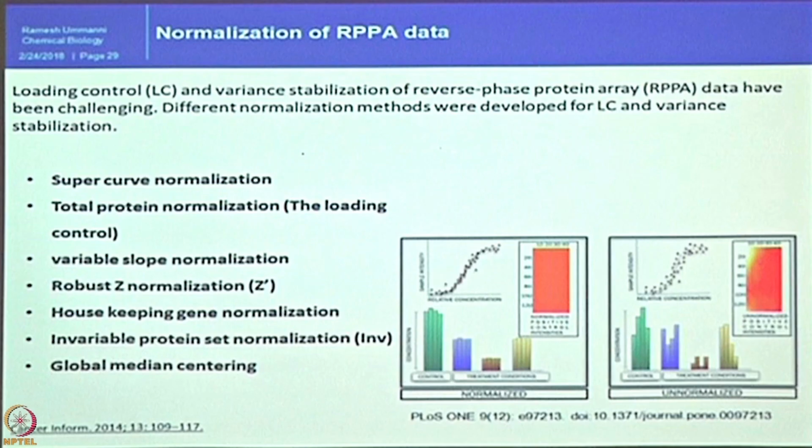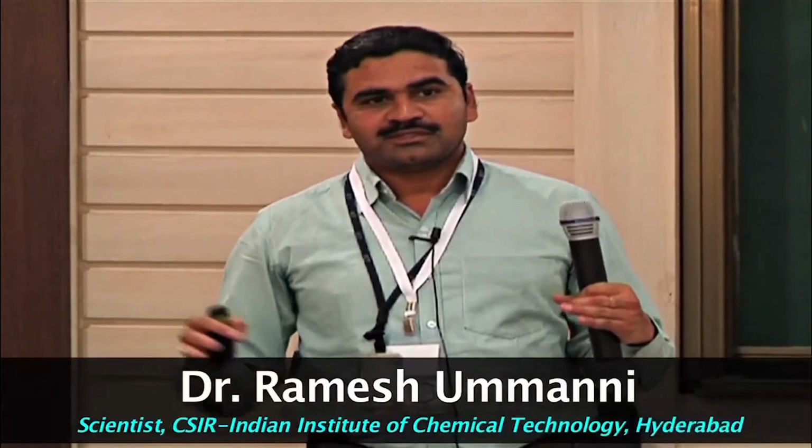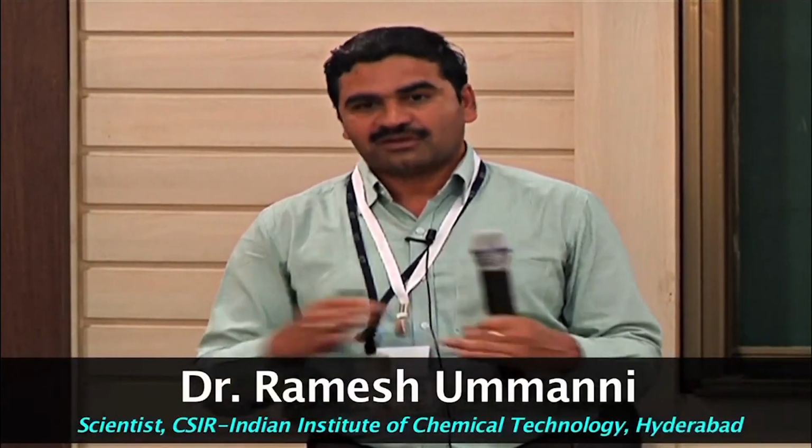One of the methods we follow in Western blot is housekeeping normalization. We are all fond of doing GAPDH more than the target proteins very often. And invariable protein set normalization. Invariable protein set normalization means in all the 1000 samples, we know that one particular protein concentration will not change. So, that will be set as a landmark. I think some of you might have done 2D gels in the proteomics approach in the beginning days. So, we used to set landmark spots. In that way those proteins expected to not change across the sample set will be set as landmark spots. Based on those concentrations we can normalize.